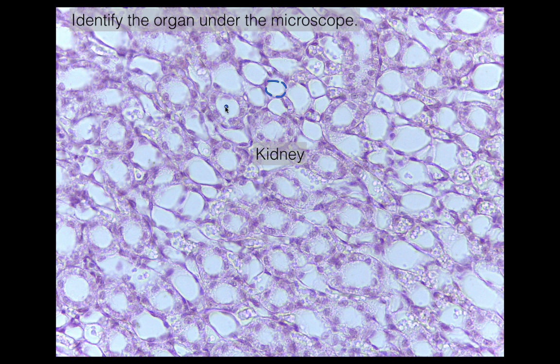You can see the difference between the loops of Henle and the larger — or I should say more thicker-walled — cuboidal collecting ducts. We have another loop of Henle here and another collecting duct here, and that's pretty much it for the kidney.